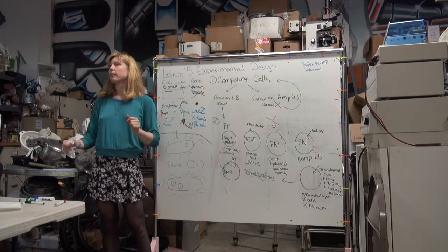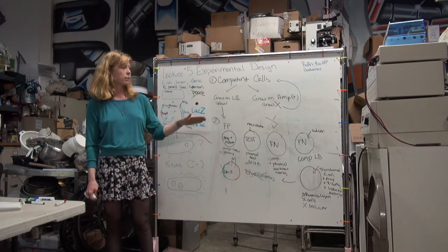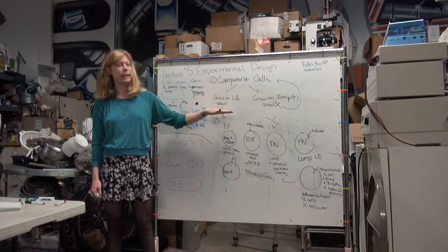So if this is true, when I plate my competent cells on ampicillin plus media, I will see no growth. Hypothesis 1, right?